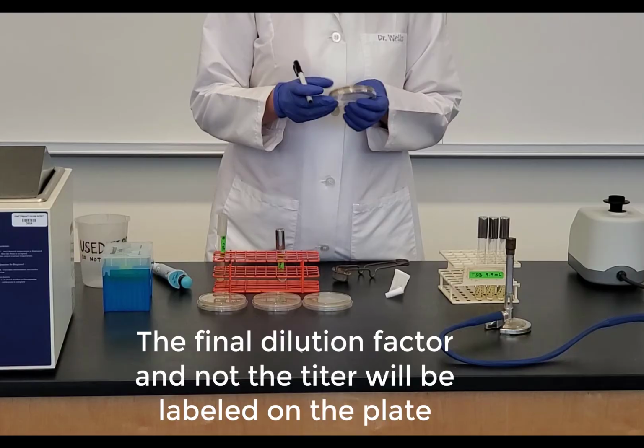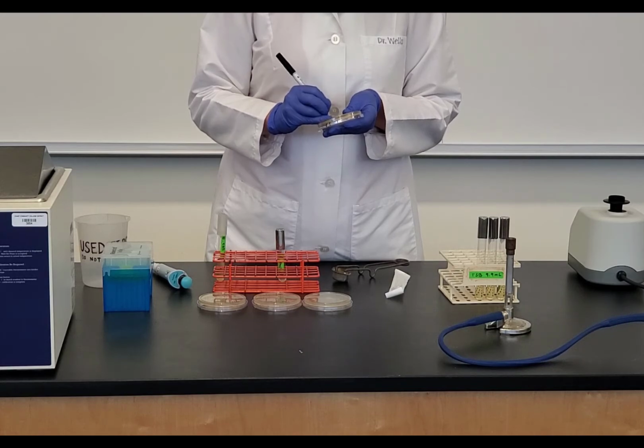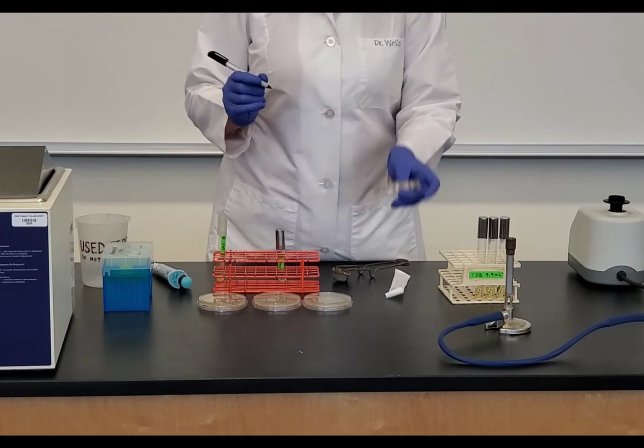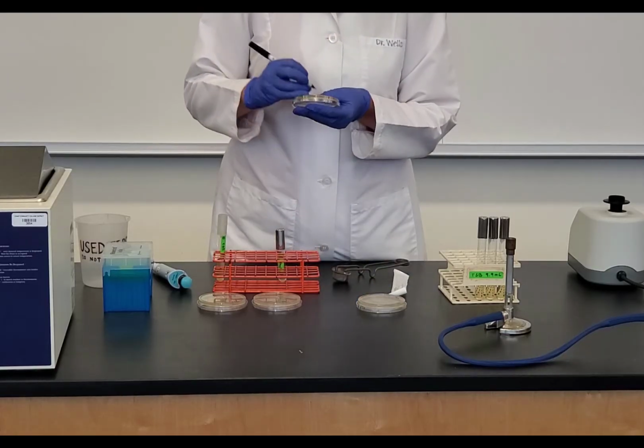That's 1. And I'm going to put the date. So today's date is going to be 4/30/21. And I'm going to repeat that for all 4 plates. Except this is my 10 to the negative 4.